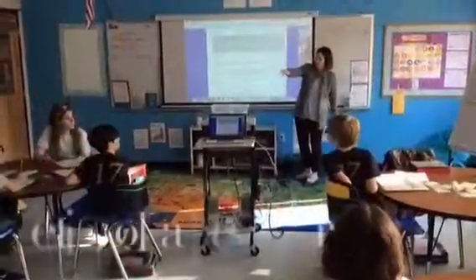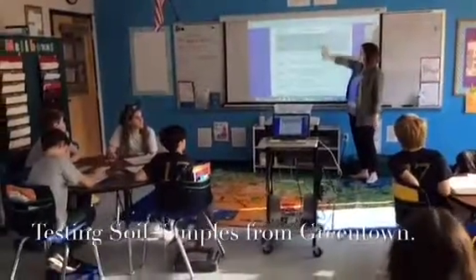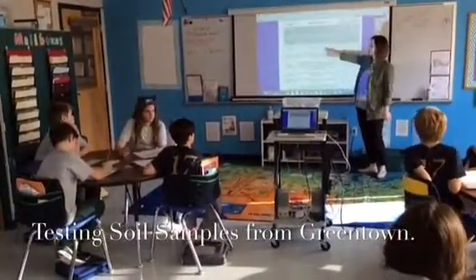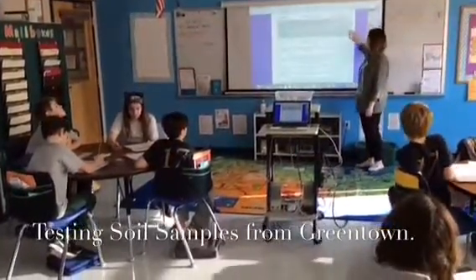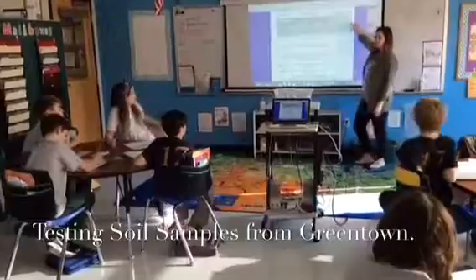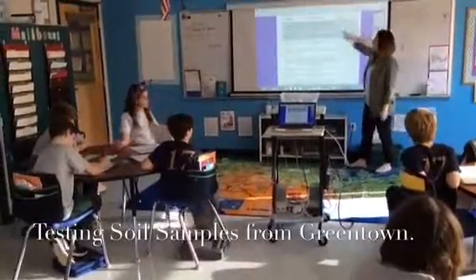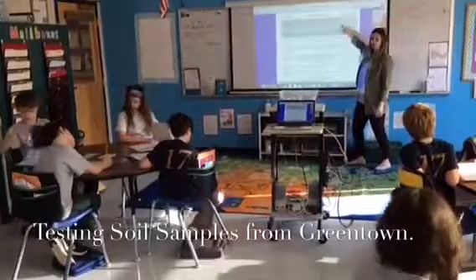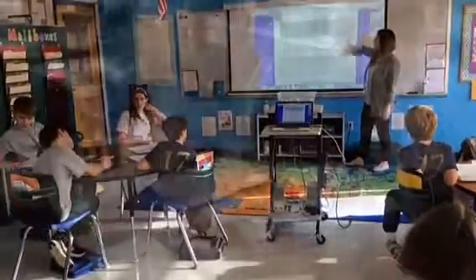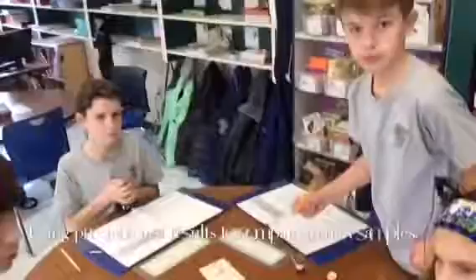So for example, if this table gets pond water, soil, garden soil and factory soil, as a team, you will test those three and you will note down what the new pH is. I want you to compare what happened from 3 years ago to now. You're going to compare the two. Can you guys describe what you're doing?